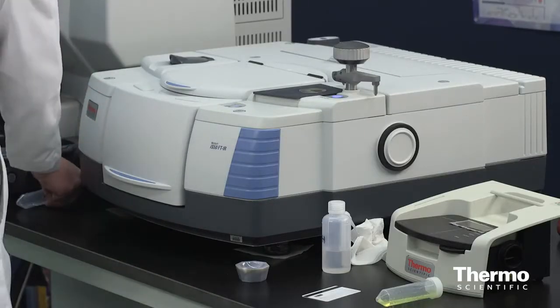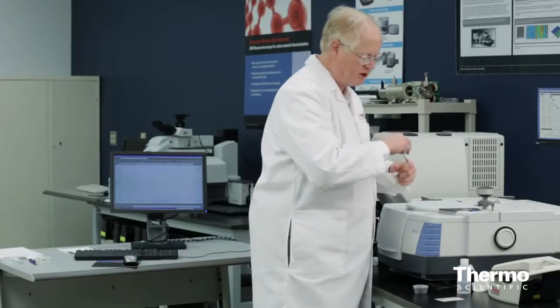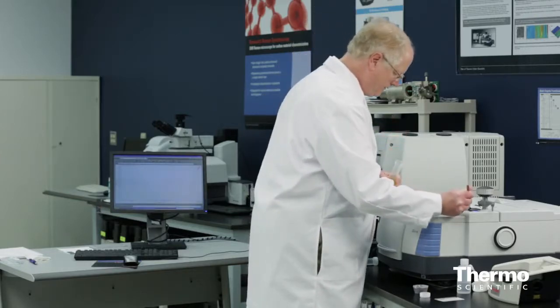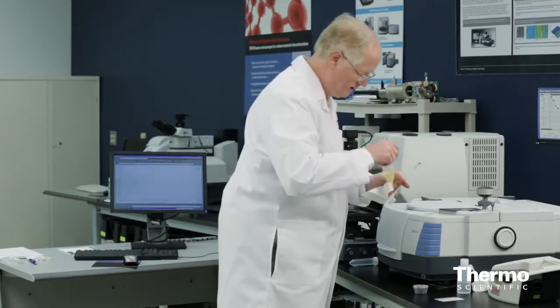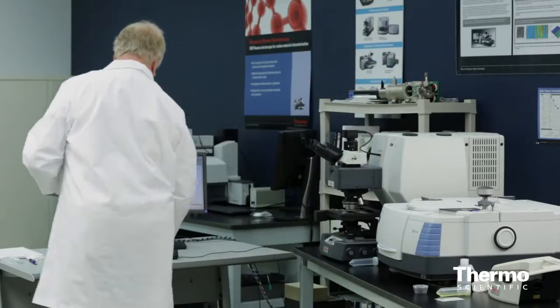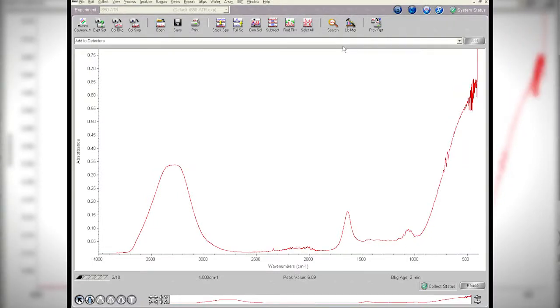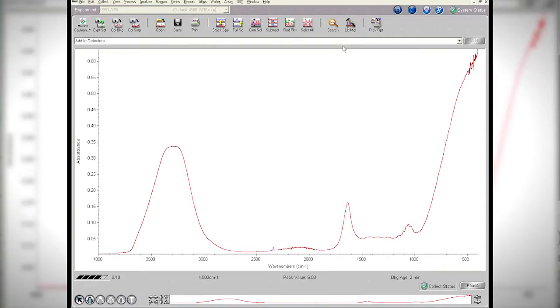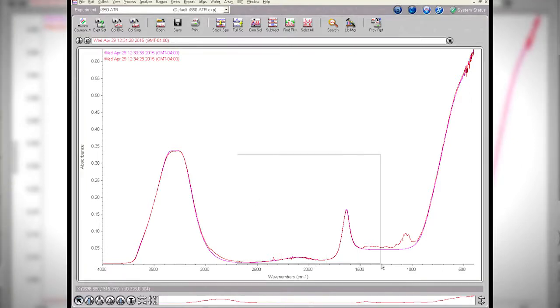Now all I'm going to do is simply wipe off that liquid, and I'm going to take this, which is a soda sample. Again, I only need a tiny amount of sample. So I'm going to place that on there. Okay. And I've got the soda on there now. Start the spectrum, let it collect. And if you look at the screen, you'll see that it's very similar, but there are also some subtle differences. This peak, and this peak we've already seen, but as you can see, there's some other things. Let's zoom in on those here in a moment and see what can be seen.